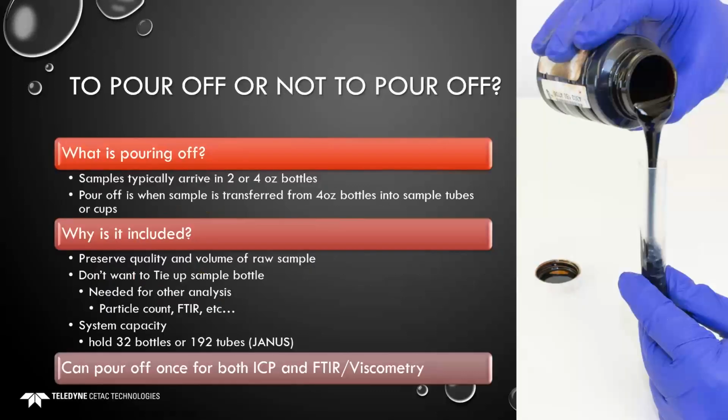So one of the workflow questions: to pour off or not to pour off? Again, some of you are going to know this. You're going to have your solution: I always pour off, I never pour off, right? Immediately off the top of your head. There are other people who probably don't have that answer. So we'll talk about it a little bit. Pour off, what is it?